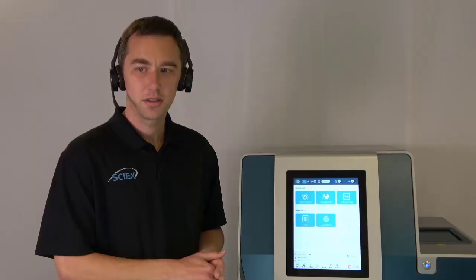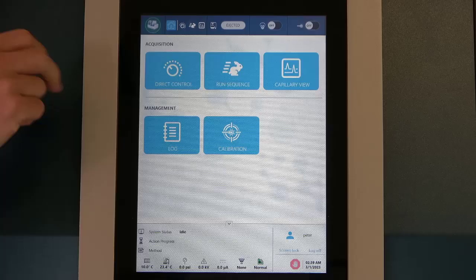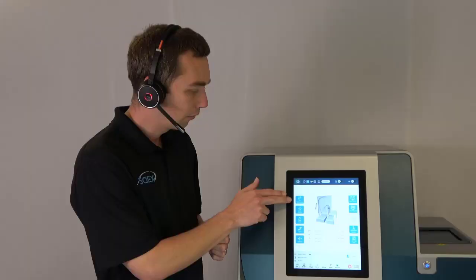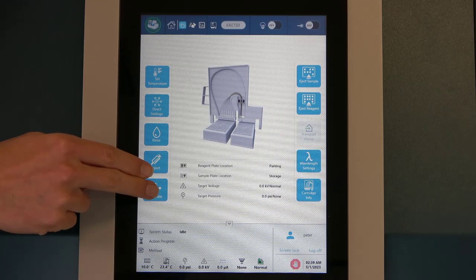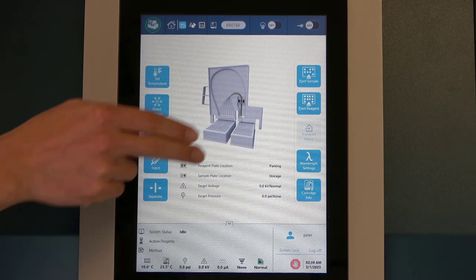Let's see exactly what all of these buttons on the front panel can do. Our first button is direct control, where we have all the same settings we're used to on our P100+. We can manually set the temperature for a cartridge or sample storage, do manual rinses, manual injections, manual separations, check our cartridge info, and this is also where we're going to load our plates.